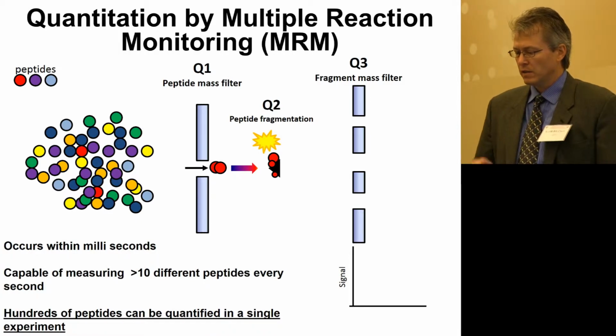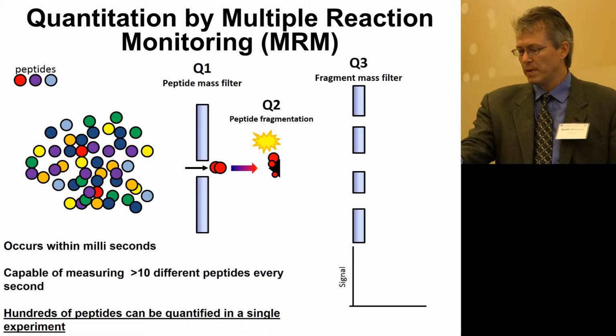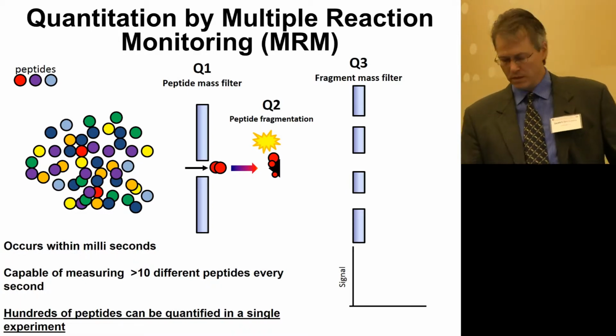So a graphic here, this is an active graphic, and so what this is intended to show is that you have some peptides and you've got a complex matrix on the left, so you've got more colors than what are shown.